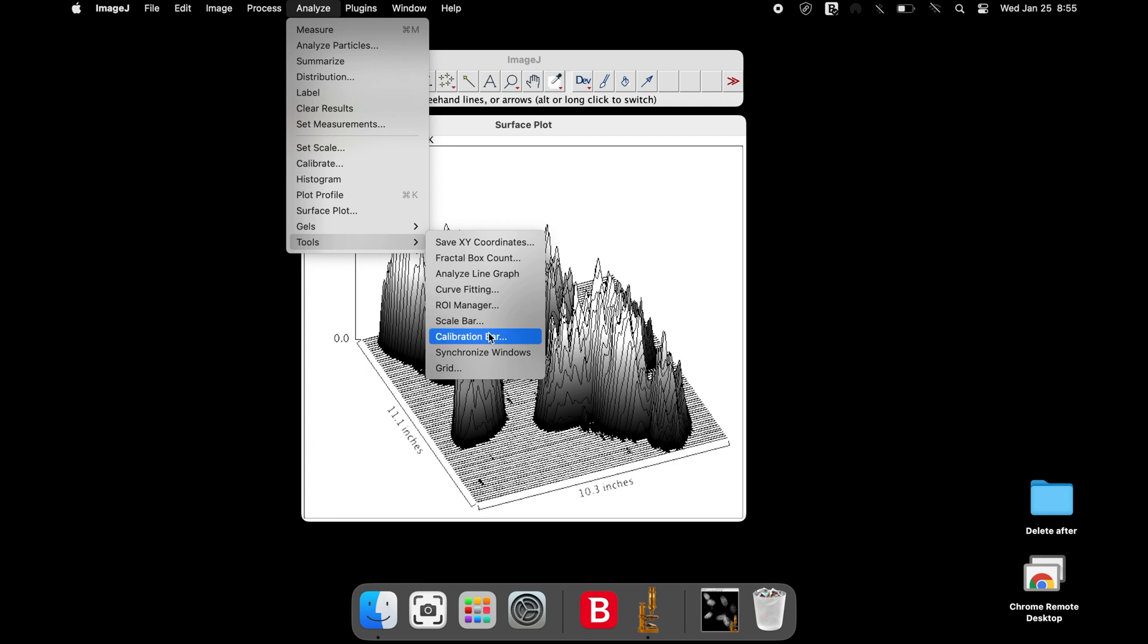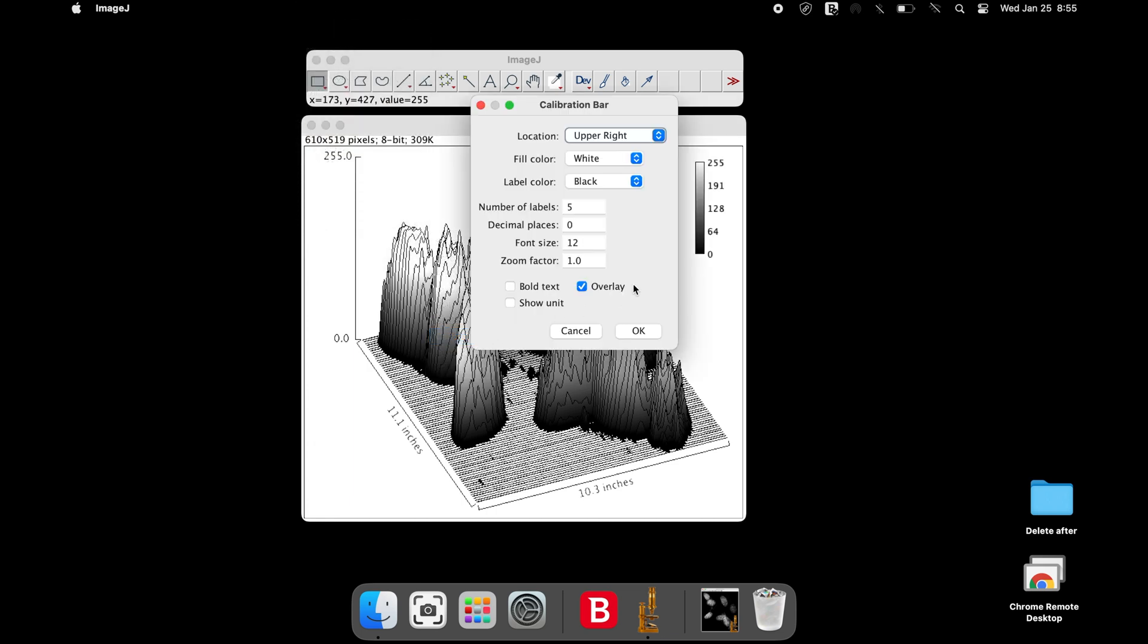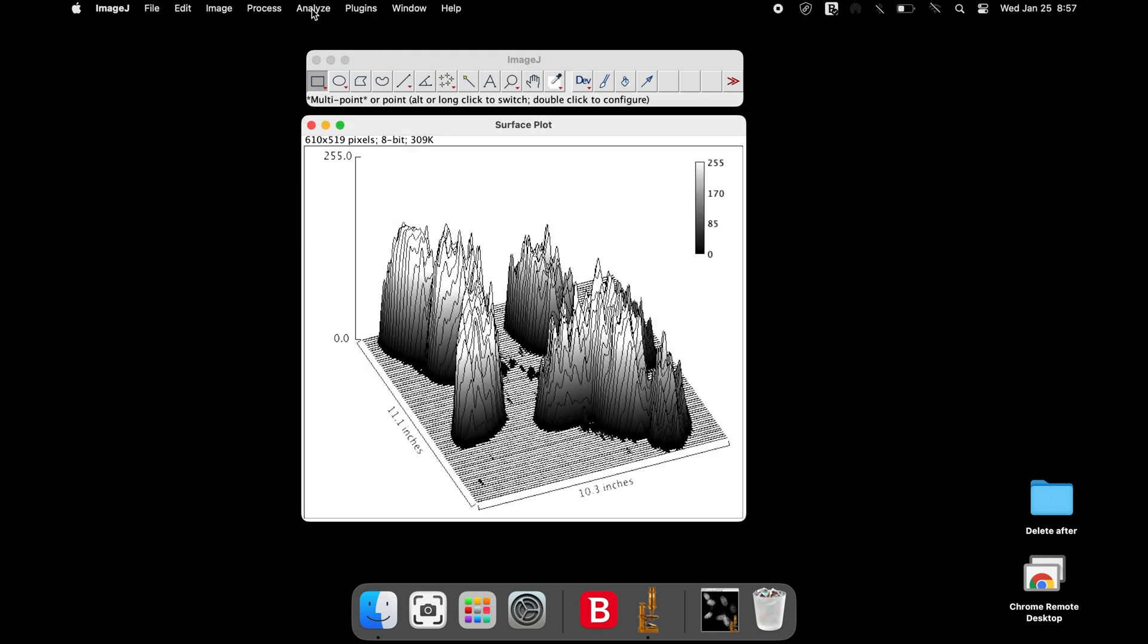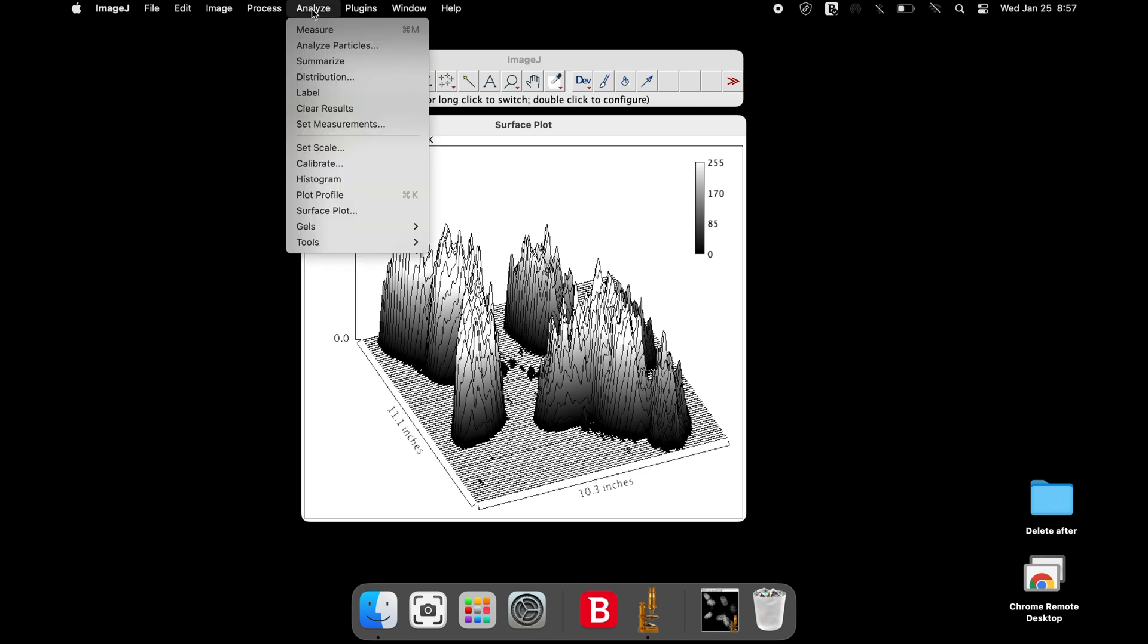The Calibration Bar window allows you to modify the calibration bar as you like it. One can also change the color of the plot instead of a grayscale surface plot.